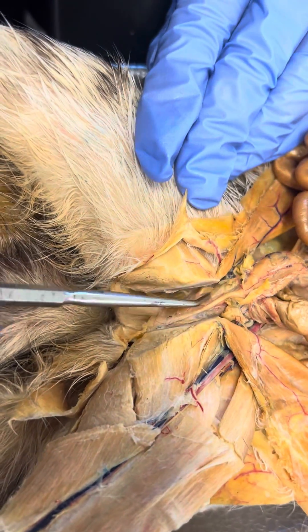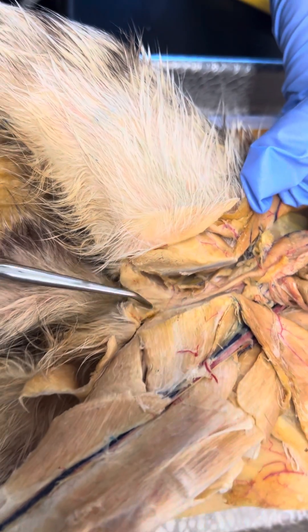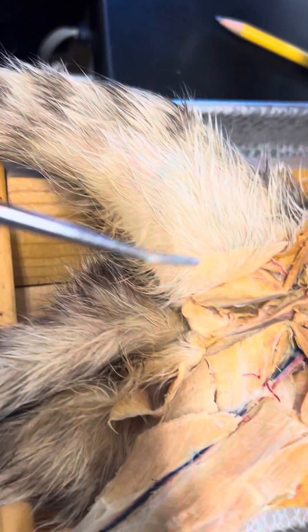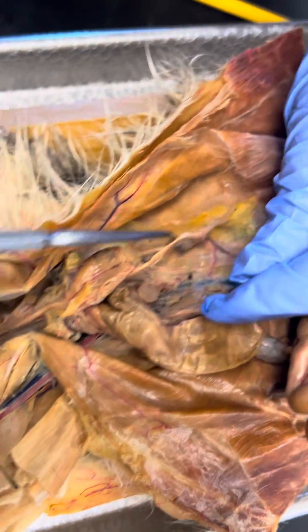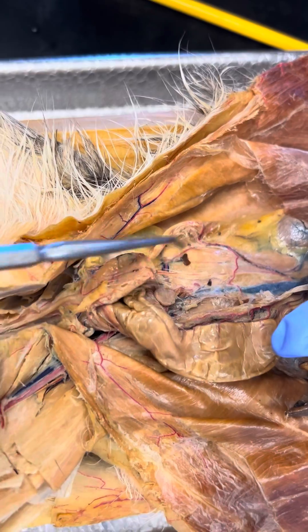Right here is the levator ani. And the vestibular. The round ligament, the broad ligament of the uterus.